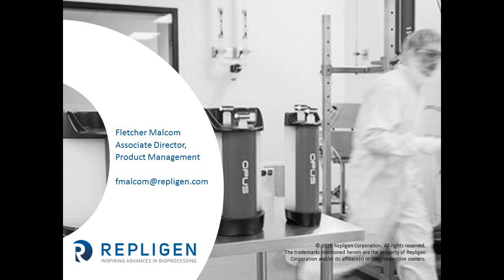Okay, great. Thanks, Fletcher. And just a reminder, you can type your questions into the chat window. So do the columns come with a certificate of analysis? Yes, so that's a good question. All of our columns, after they're packed and when they leave our facility, are tested for asymmetry, plate count, and any other specifications that we may have, like bioburden and endotoxin. And all of that data goes on the certificate of analysis, which then gets shipped with the columns.